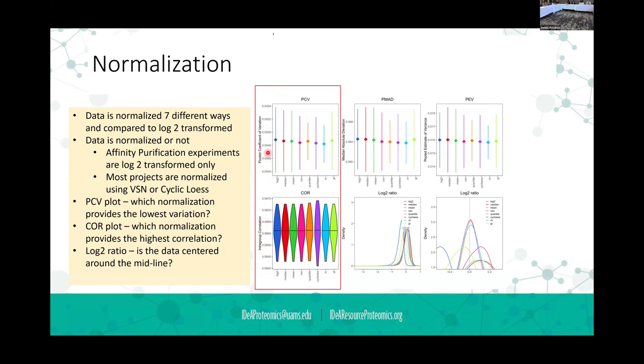You only have to look at a few dozen of these to realize that a lot of times these different methods, median normalization and VSN and cyclic LOESS and all that, they all normalize basically about the same. There's some that'll do a little bit different, but they're all pretty much the same. On a good data set. On a good day.